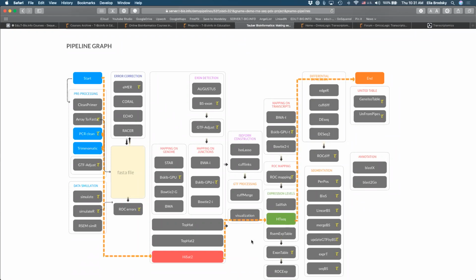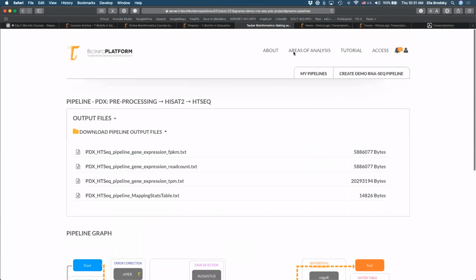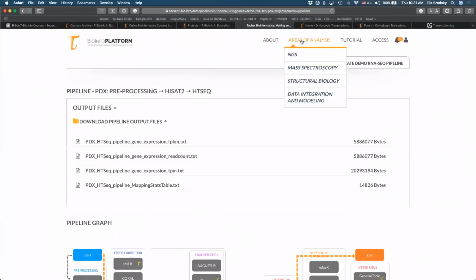Now, beyond this pipeline, which seeks to produce structured data from unstructured data, which comes out directly from the sequencer, we will also look at how to analyze such data. For example, we can look at the data in the gene expression table to study different patterns and even visualize them. Because there are so many elements to analyze, this could be done in an automated way using different types of scripts.